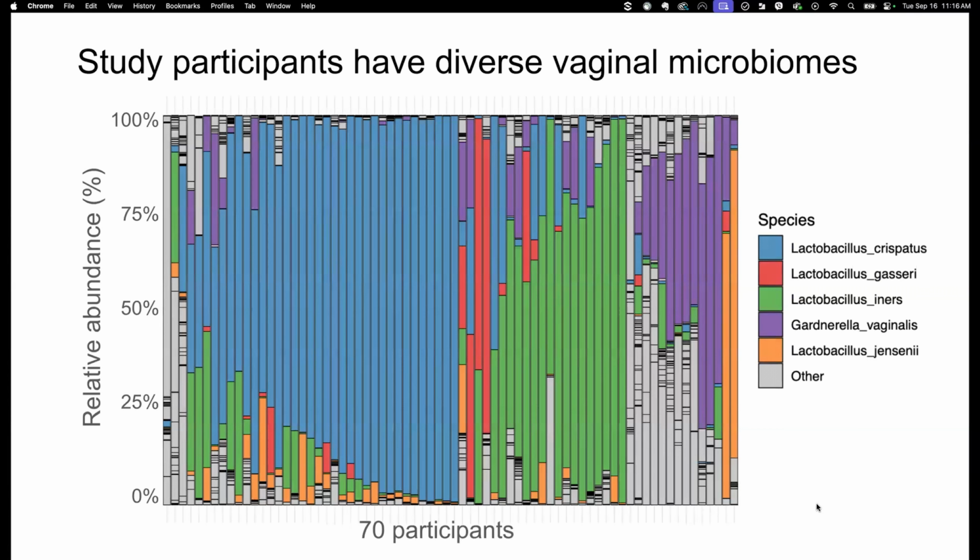Okay, so what can we do with these data? Quite a few things. I'll start with the species level data. Here we've organized the data such that each column represents an individual, collating all of their data across all time points into one snapshot per individual. On the y-axis is the relative abundance of the various bacterial species that we could detect using the Kinnex data. I'm sure you can see there are lots of different colors. It seems that there are certain species that really predominate, which we expected to see.